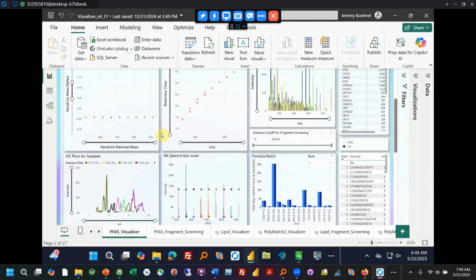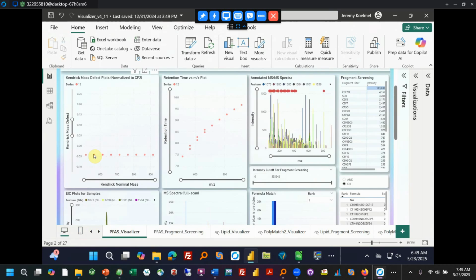So now here's our series. Looks very good. This data, the AFFF contaminated soil, this is actually NIST C from a PFAS interlab. And this data looks way better than you should expect your data to look like. So just because you don't have these nice series and as many compounds annotated in your data set, even if it's AFFF, don't worry.